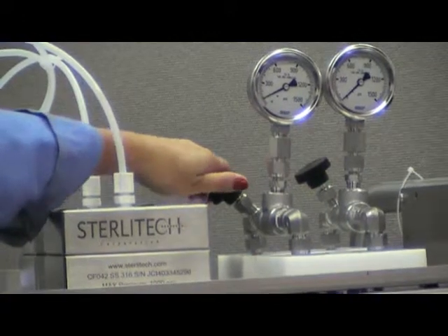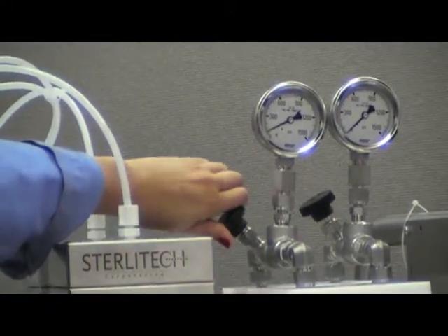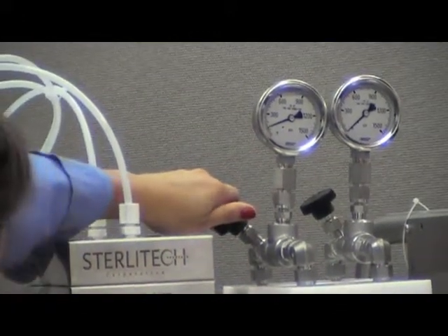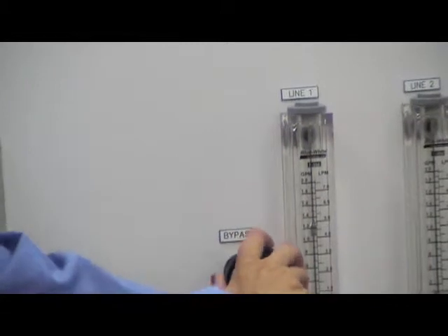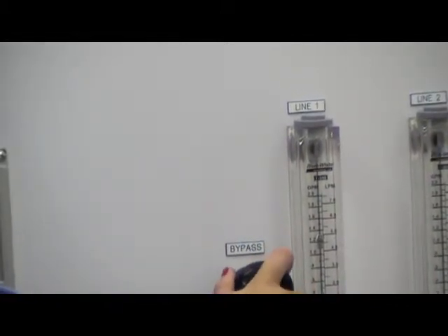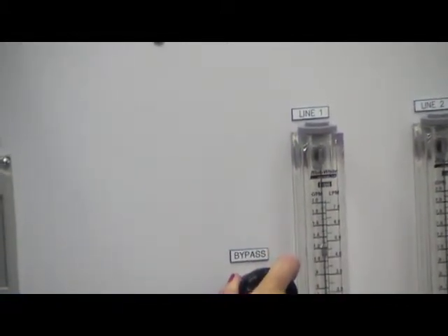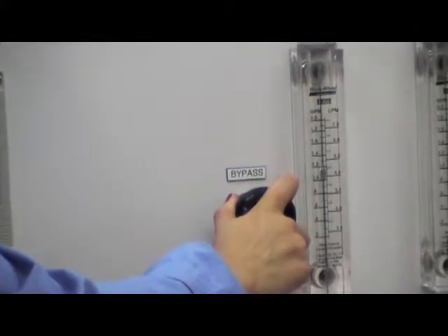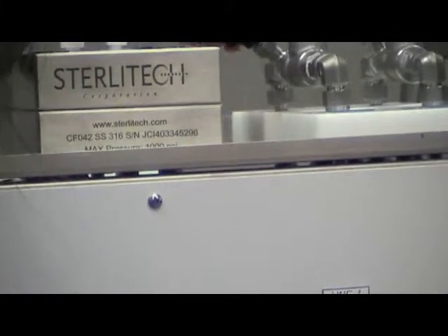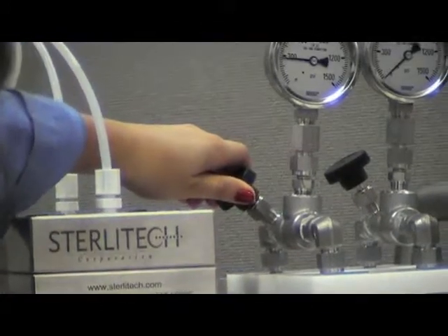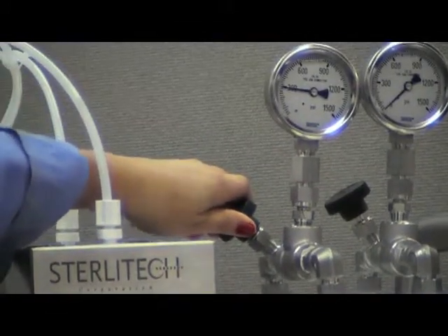We're slowly starting to see the pressure gauge work its way up to 300 psi and I'm trying to maintain the flow at about 1.4 gallons per minute. To do so I have to constantly or consistently adjust the bypass valve. And we're there.